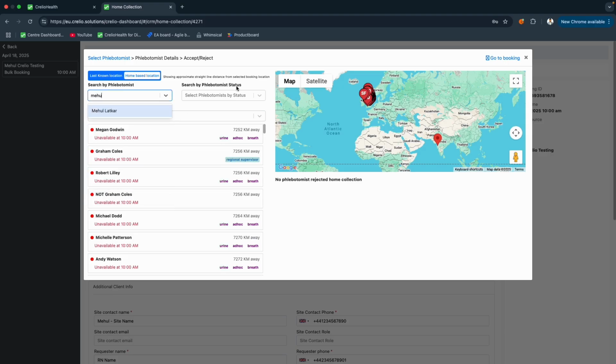We can search by the phlebo name or phlebo status. These are all the phlebo statuses. Phlebo statuses again can be configured and assigned to particular phlebotomists. We will see that in another video wherein we understand the configuration of phlebos.